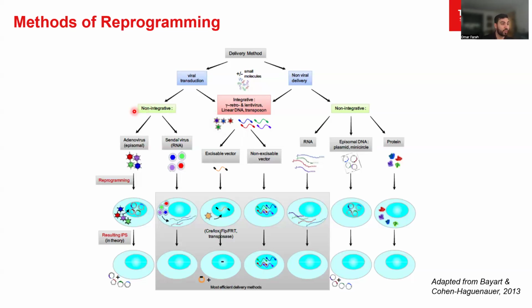In our case, we want them to express the four transcription factors, the Yamanaka factors. But then after these cells reprogram, you don't need that construct to stay in the cell, and we call that vector clearing, right? So at some point, we want to make sure that those vectors are no longer expressed in the cell.